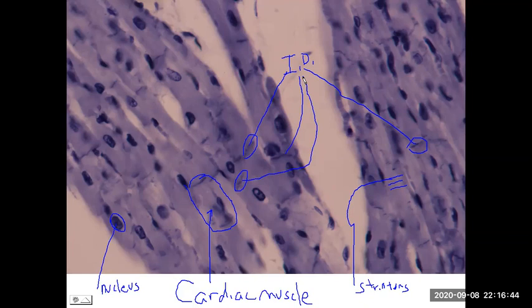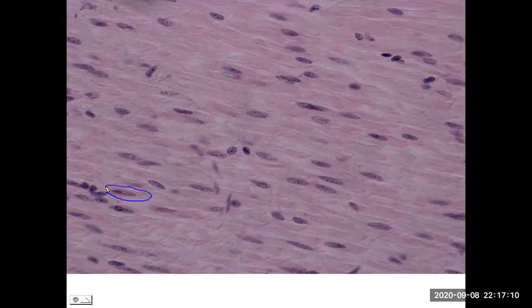And our last type of muscle, we did skeletal muscle, cardiac muscle, and now smooth muscle. And for smooth muscle, again, we're looking at smooth muscle tissue made of individual smooth muscle fibers or smooth muscle cells. And to try to find an individual one, here would be a good example. One kind of stands out by itself. If I were to sketch it out, they're thinner on the edge, a little thicker in the middle. So these spindle-shaped cells are the description of a smooth muscle fiber.